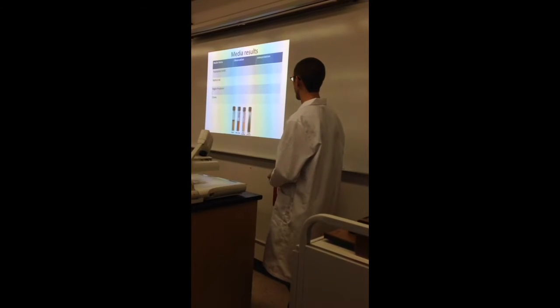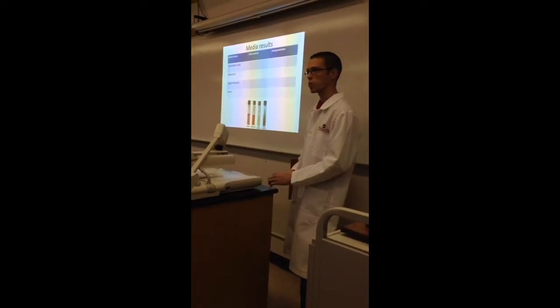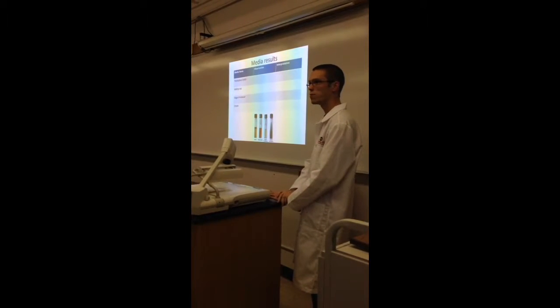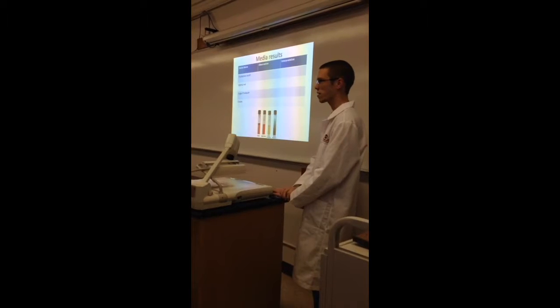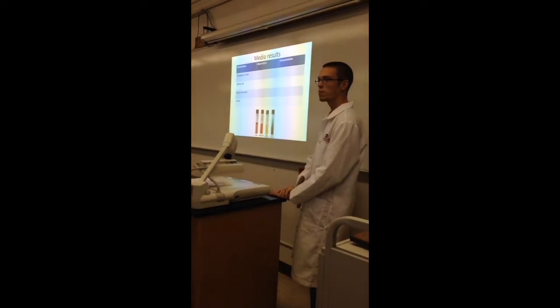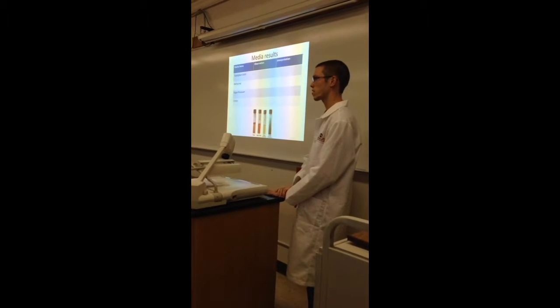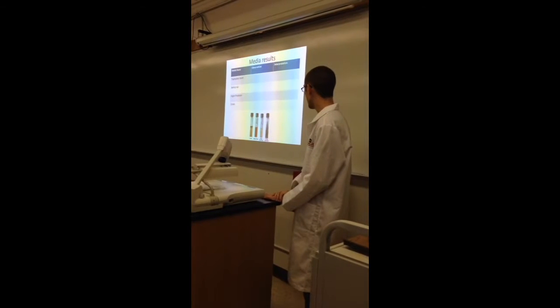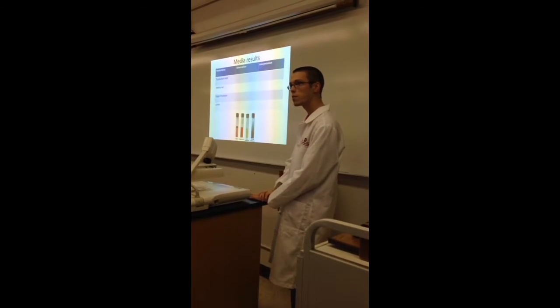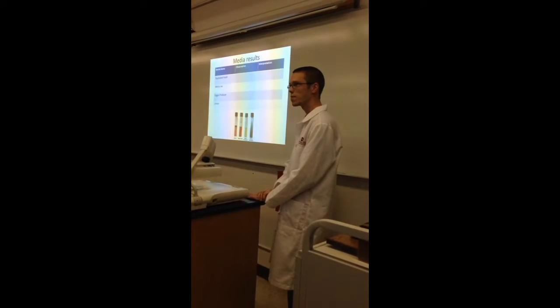A good example of that is for methyl red. What would the interpretation for methyl red be? It's not just methyl red positive. That would be partial credit, because at least you knew that red was positive and yellow was negative. Right, so red on methyl red indicates mixed acid fermentation. What about for Vogts-Proskauer? Does anyone remember what that represents? All right, I'll bring it up.